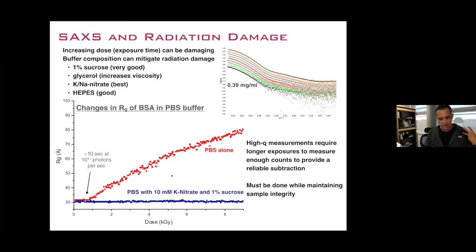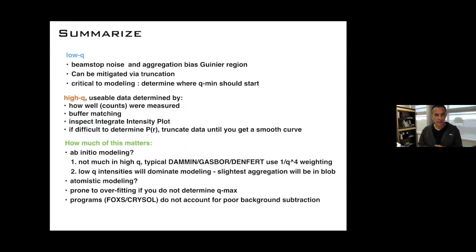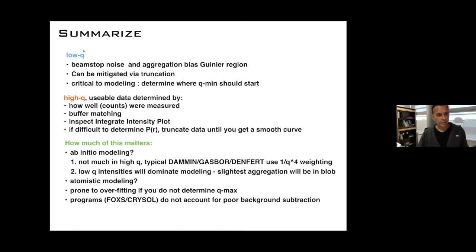When you do SAXS and see that your sample is sensitive to radiation damage, think about increasing the buffer concentration — if it's Tris, maybe go to 100 mM Tris — or add an additive like sucrose to help deal with that.